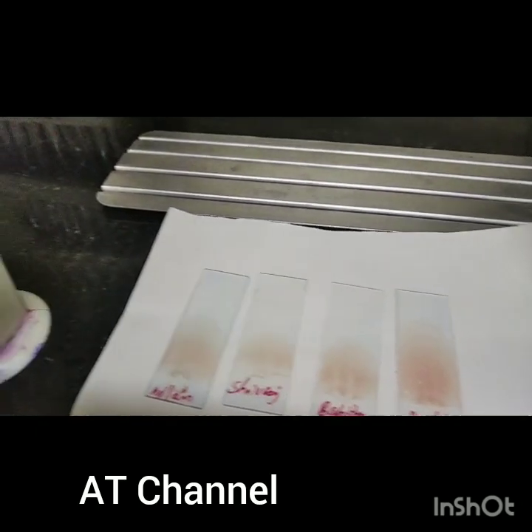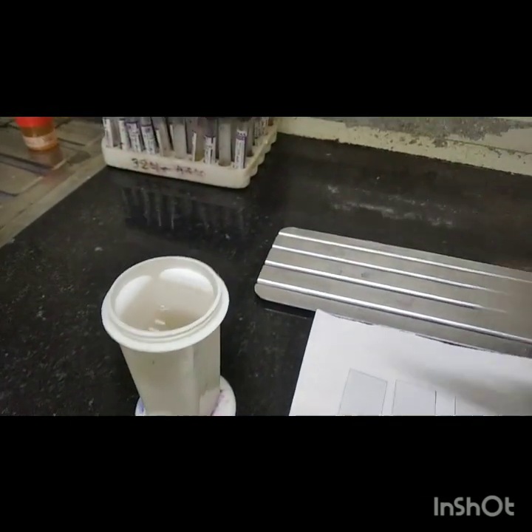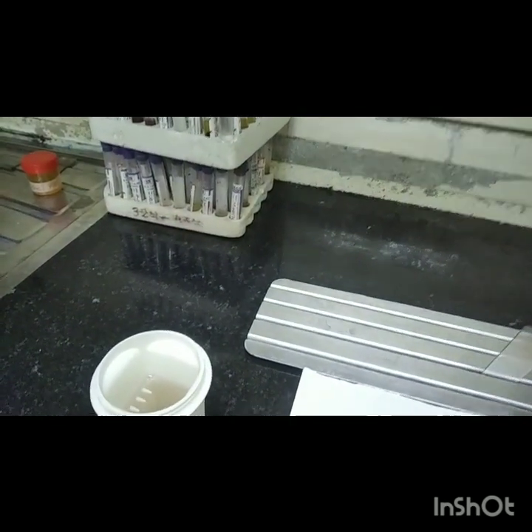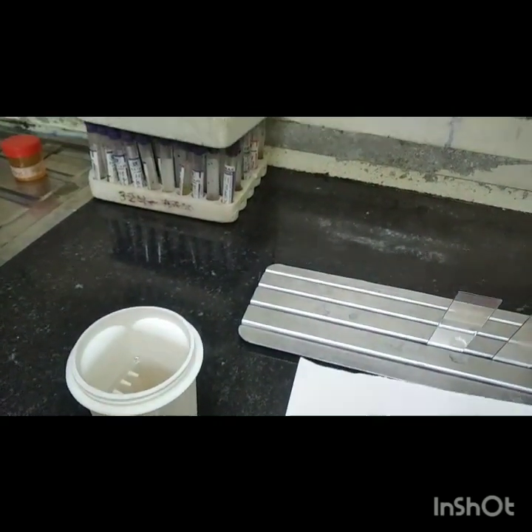Good morning. I am Reggie from AT Channel. How to make the blood smear look like that? Make the smear and then put it into the spirit or fixative. Wait for some time for the drying.